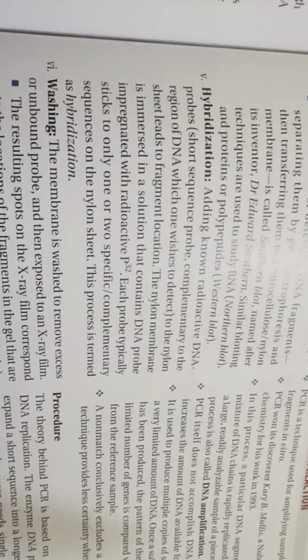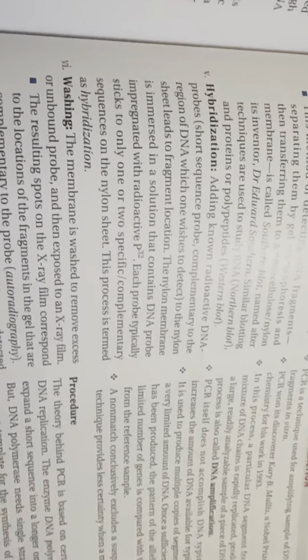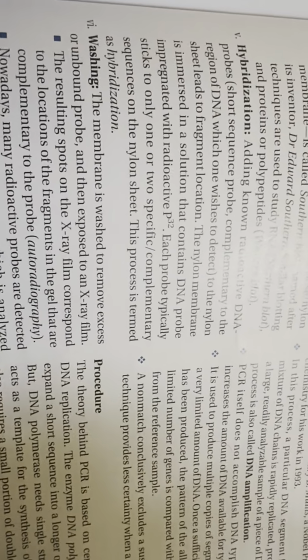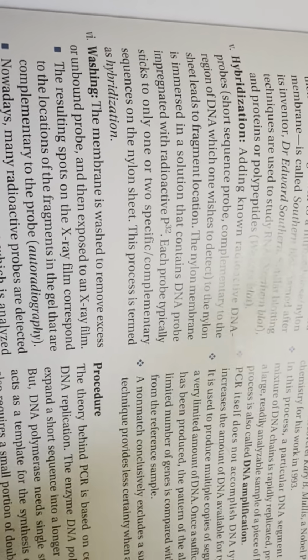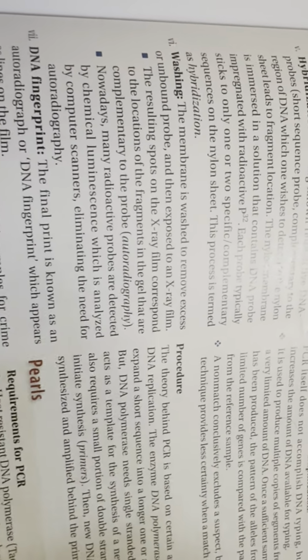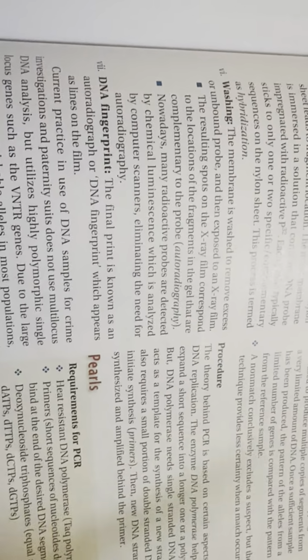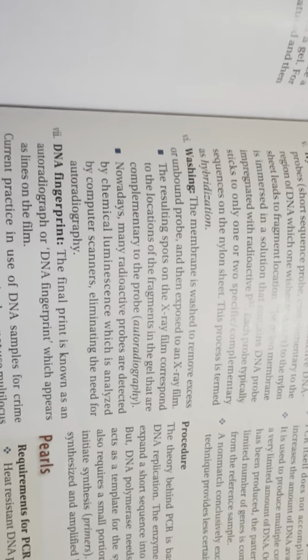The nylon membrane is immersed in a solution that contains DNA probe impregnated with radioactive P32. Each probe typically sticks to only one or two specific complementary sequences on the nylon sheet. This process is termed hybridization. Washing: the membrane is washed to remove excess unbound probe, then exposed to an X-ray film.